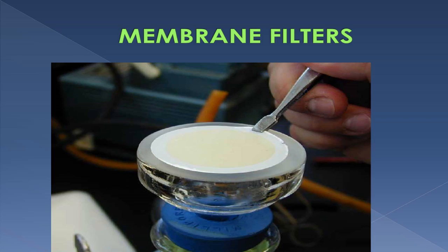The membrane filter technique is an effective, accepted technique for testing fluid samples for biological contamination. It involves less preparation than many traditional methods and is one of a few methods that will allow the isolation and enumeration of microorganisms. Membrane filters are used extensively in the laboratory and in industry to sterilize fluid material.